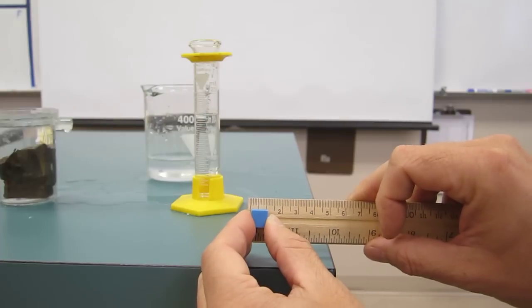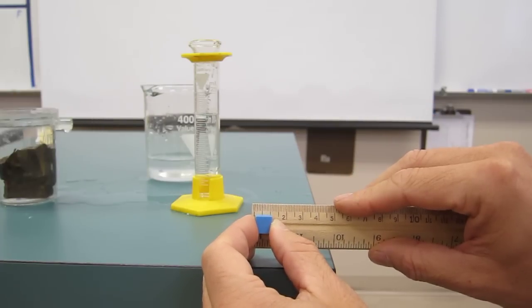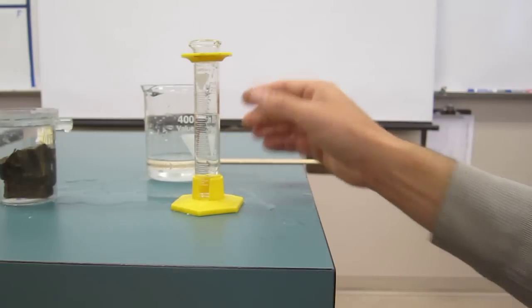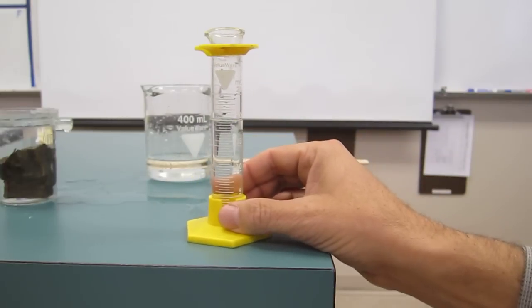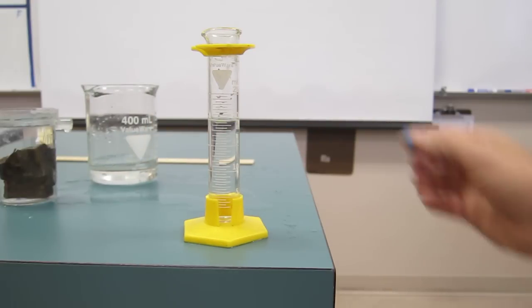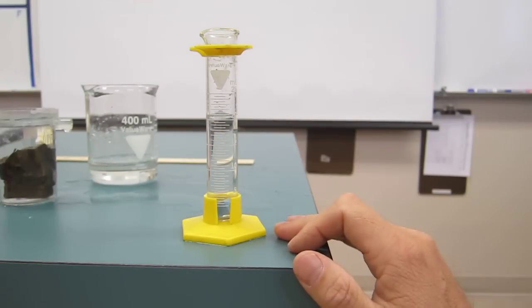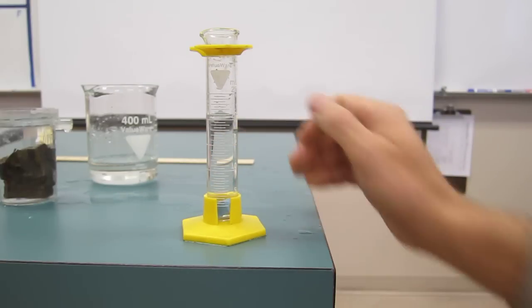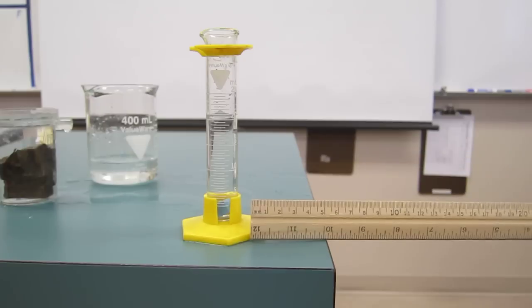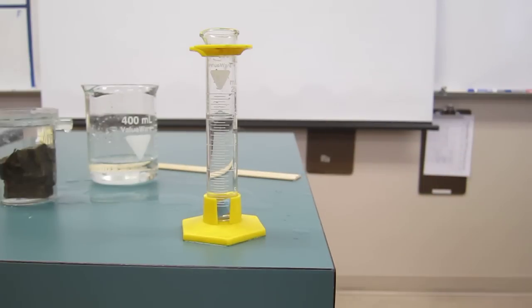So you can tell that the volume is 1.0 centimeters cubed. So what students did after that, they compared it with this method of displacement, where you have 20 milliliters of water in here. You put this in, and it goes up to 21 milliliters of water, also 1 milliliter. This proves to you that a centimeter cubed and a milliliter are the exact same thing. That should be enough to finish up your handout at home if you were absent for the lab.